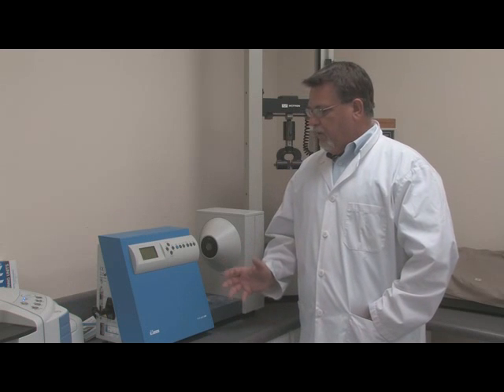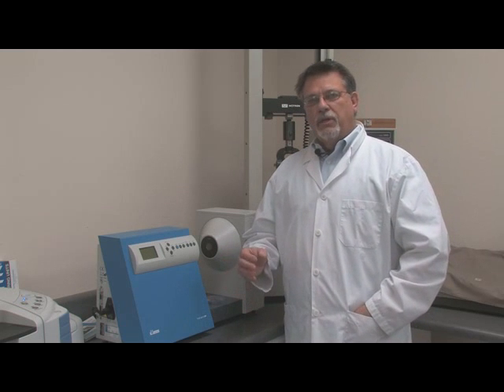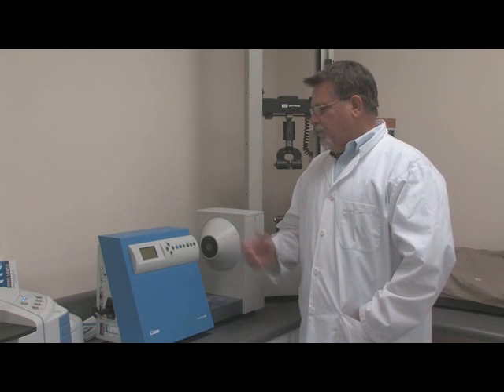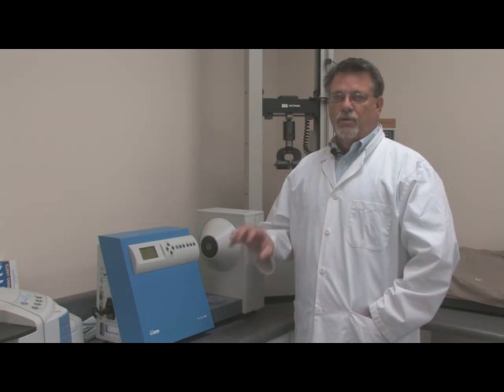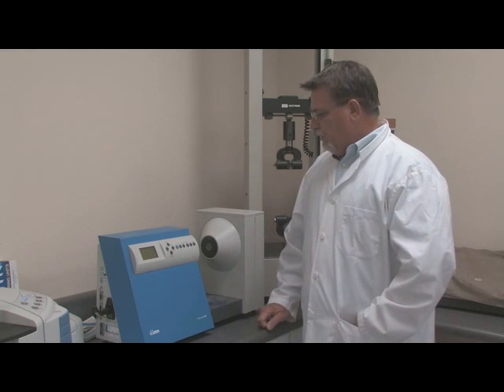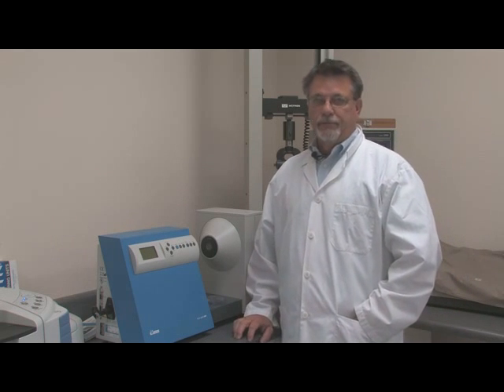And so this device here, in terms of both the base polymers and then also in the cases of materials that we have treated and put on special optical coatings, this particular device helps us identify and be sure that we're in spec in terms of those light transmission and clarity issues. It's a clever little tool and comes in handy when you're looking again for the best optical properties of a polymer.